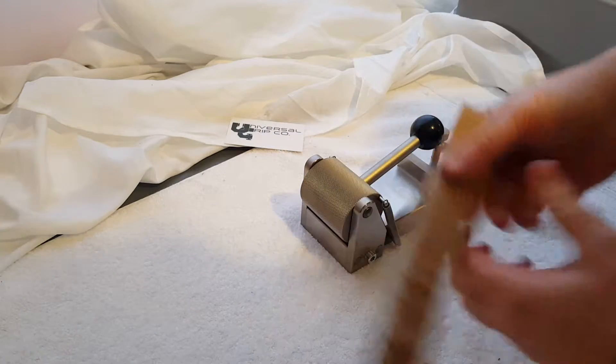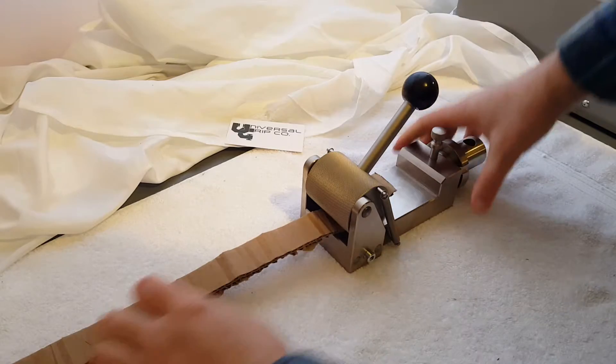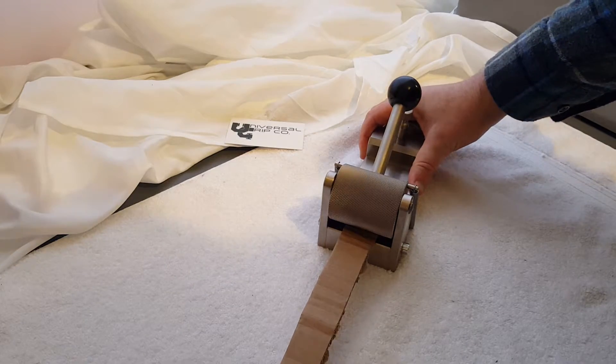I'll show this piece of cardboard here — throw that into the roller. Now as I pull, you'll see it tighten. The more I pull, the more it tightens down onto the sample.